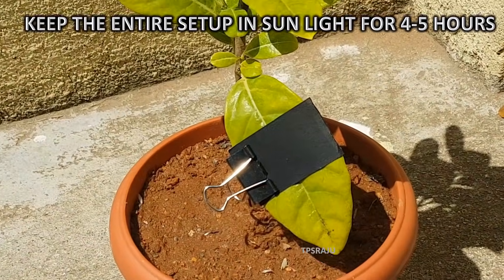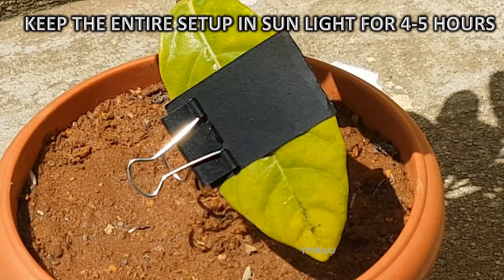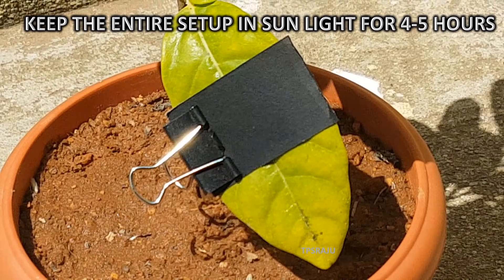Keep the entire setup in sunlight for 4 to 5 hours. The part of the leaf covered by black cloth is not exposed to sunlight.